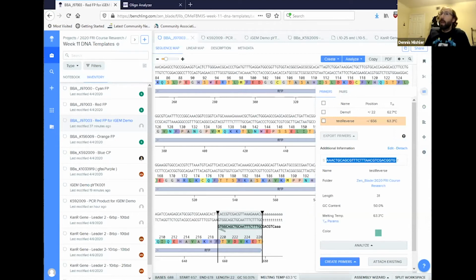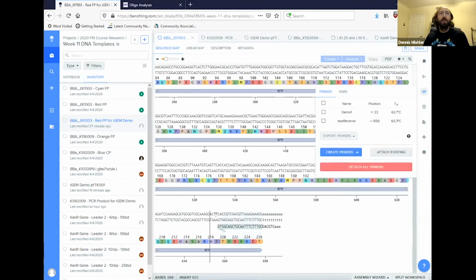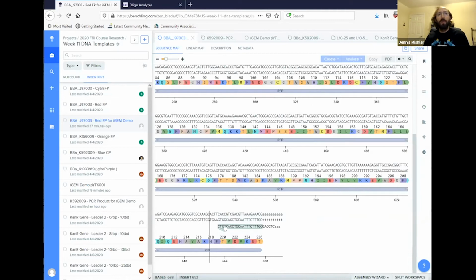So it's probably okay, this primer is probably okay, but if I did the PCR reaction and I did not get product after a couple of attempts, I'd be very worried this primer was not good. One of the easiest solutions for that, though, is just to make the primer longer on the inner side. So if you just add a few more nucleotides here, you'll pump up the melting temperature, and often that'll be enough to get around the problem. Okay, you can just increase that a little bit if you need to. Now, guys, again, this is just a general rule of thumb. This is not always going to be the case in every single set of PCRs or every set of primers. So do take that into account.